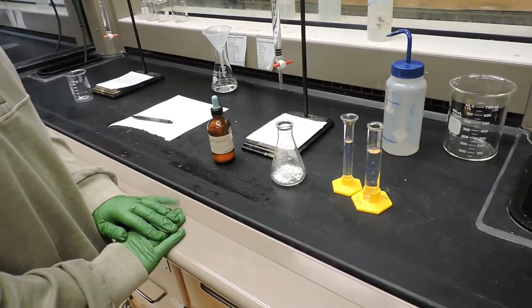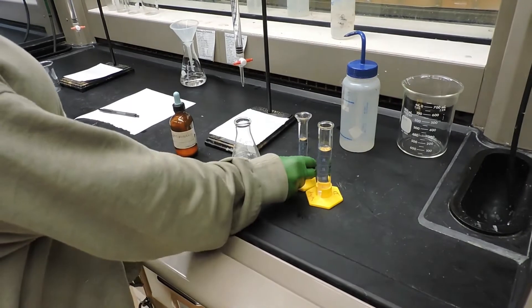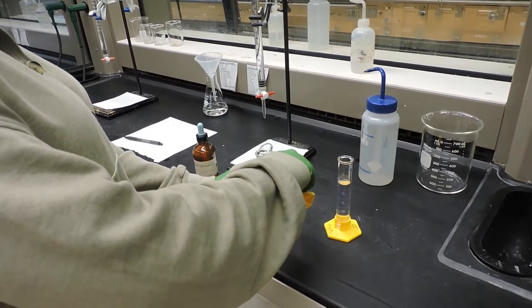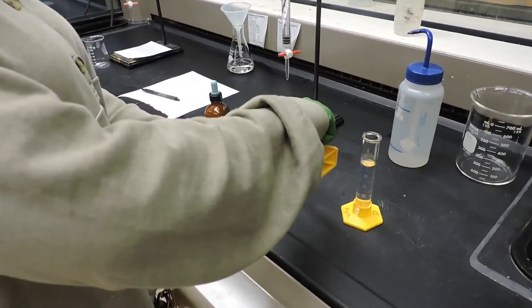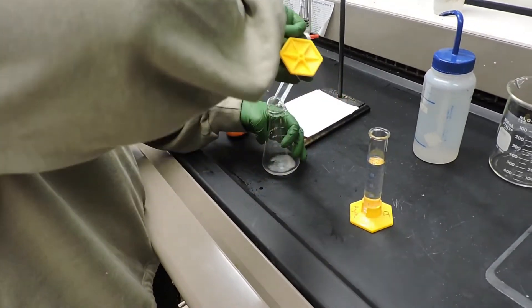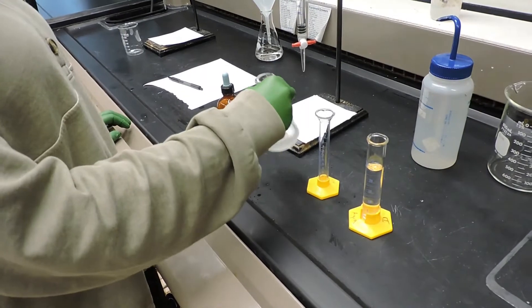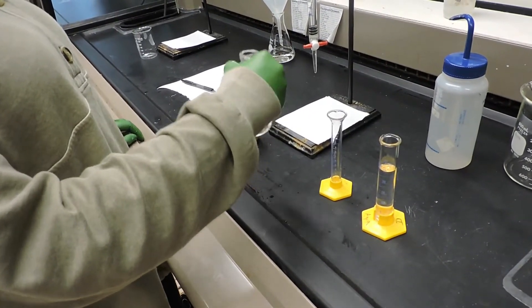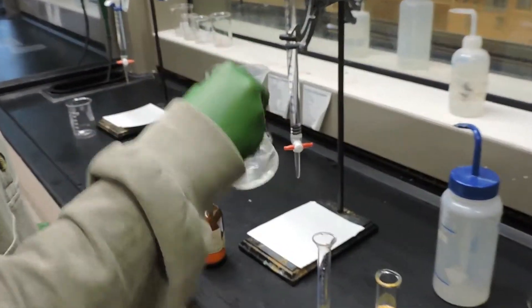To this Erlenmeyer flask we will add approximately 10 milliliters of 95% ethanol solution and mix to dissolve the acid. Following this, we will add about 25 milliliters of deionized water and mix well.